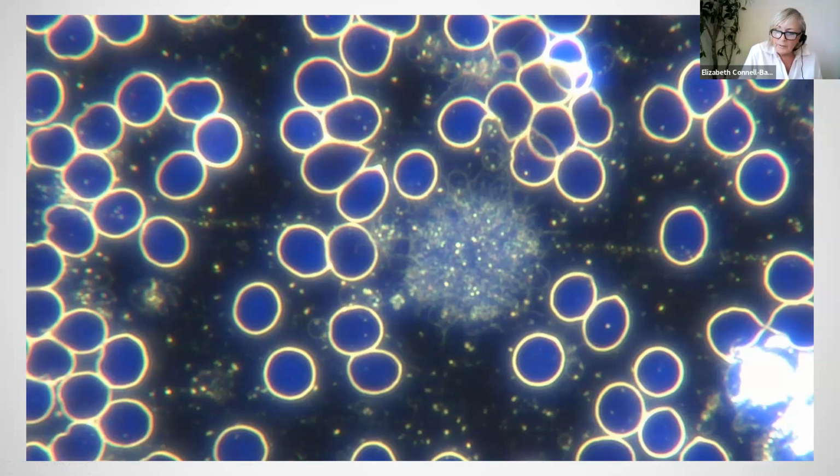Juan is asking, are environmental toxicities approachable with dark field microscopy? Microplastics, for example. Well, there are indicators for toxicity that we see in the blood. In live blood, we really see signs of the effects of toxins. So we would see damage to the blood cells and stress on the organs of elimination as a result of that. Dry blood analysis often helps to guide us in terms of where the toxins are coming from. Because of the map that we use when looking at the dry blood sample, we often would find indicators that the toxicity may be more environmental based on where specific patterns show up in the dry blood. So yes, there is some guidance with regards to the anomalies there.